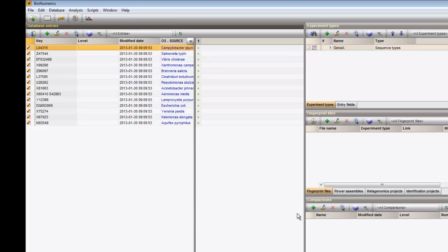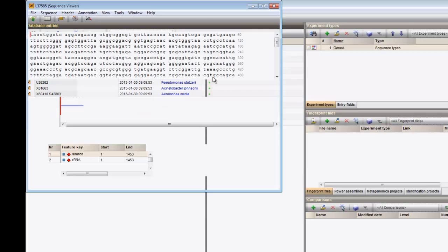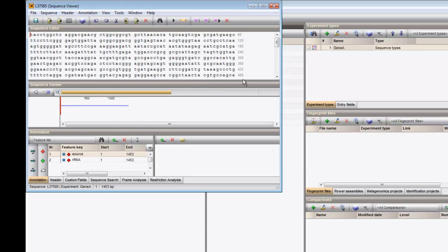The sequences are now added to the database and the corresponding entries are selected. By clicking on a colored dot, you can view the content of the sequence viewer.